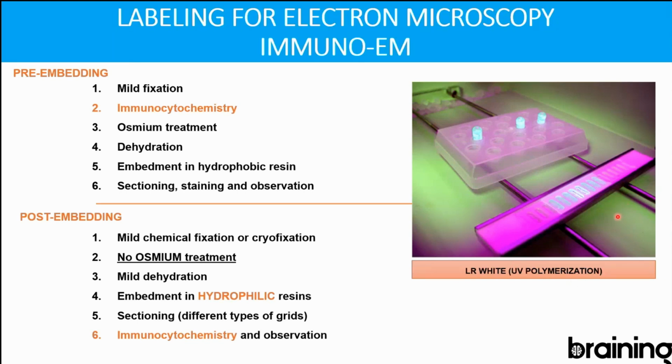And actually, this is going to be in a freezer, so we don't get too high a temperature in the tissue, in the block, I mean. After we have cured this without heating the resin, we get ultra thin sections and then observation.